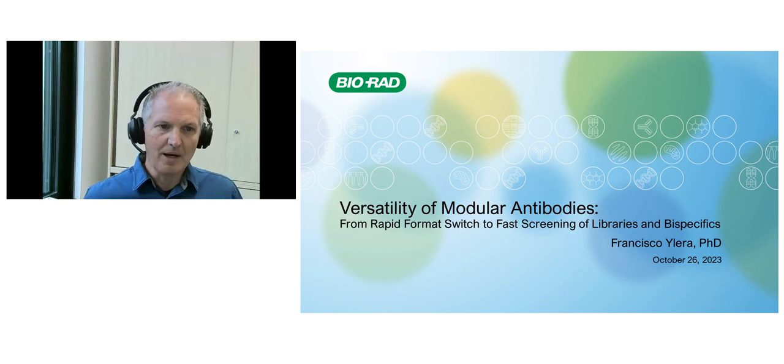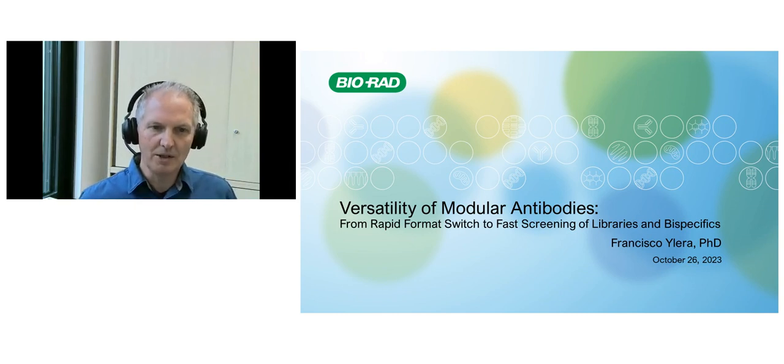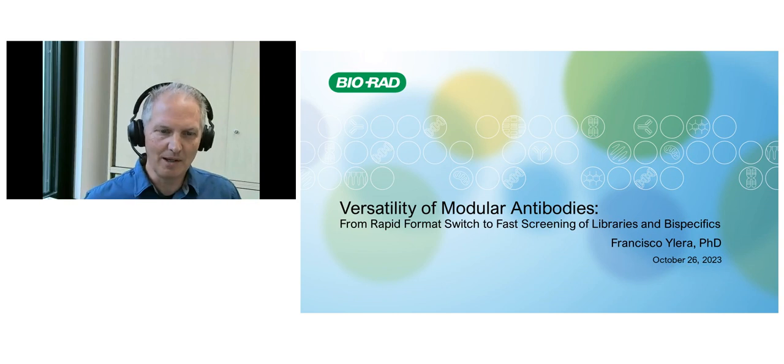And in this webinar, I will present how many additional options you have by adding a tag to your antibodies, especially or namely the SpyTag.